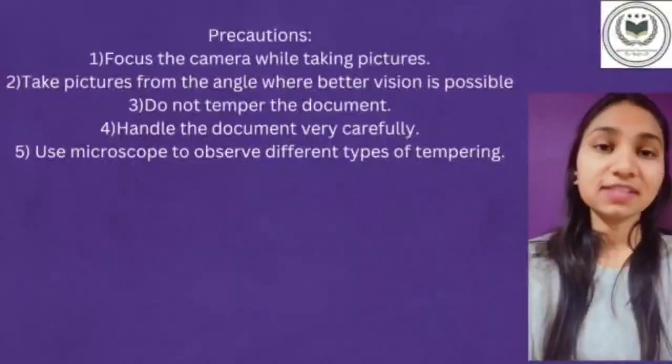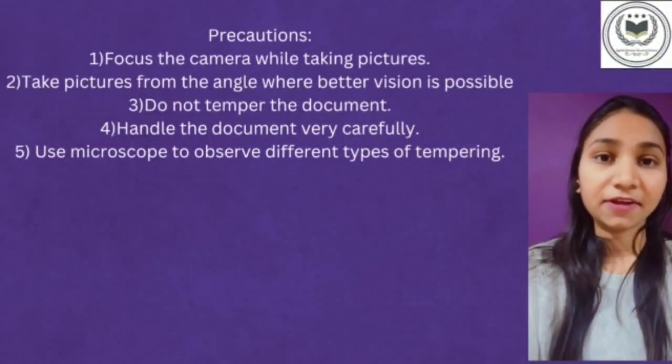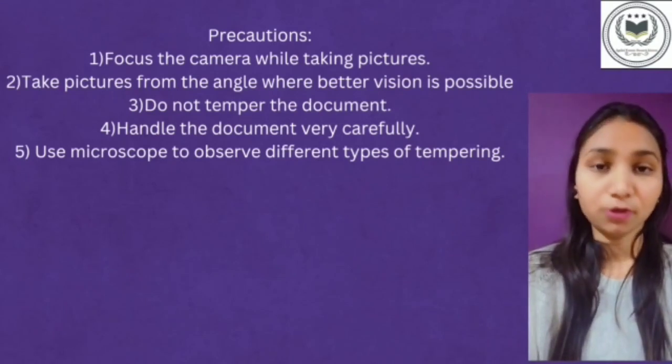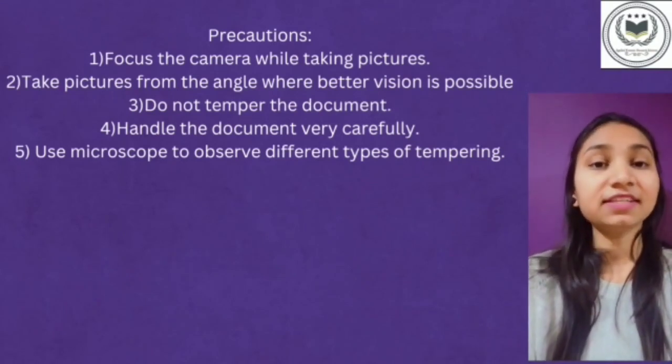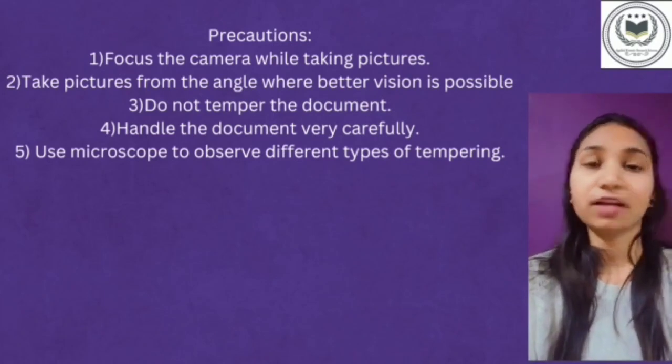Precautions. First, focus the camera while taking pictures. Second, take a picture from the angle where better vision is possible. Third, do not tamper with the document. Fourth, handle the document very carefully. Use the microscope to observe different types of tampering.